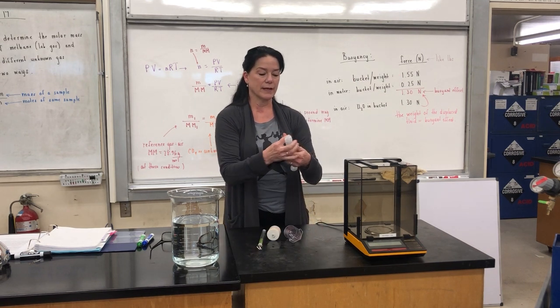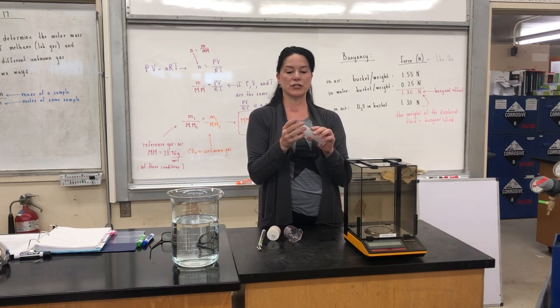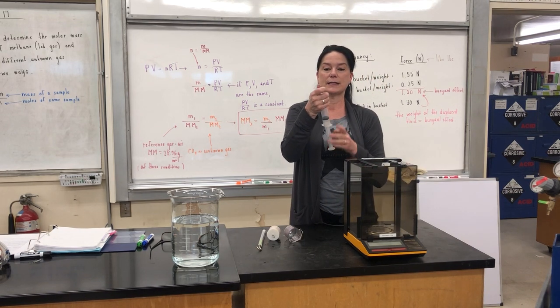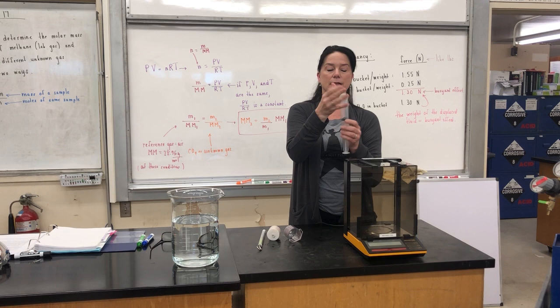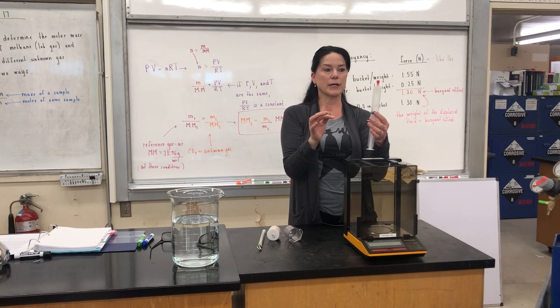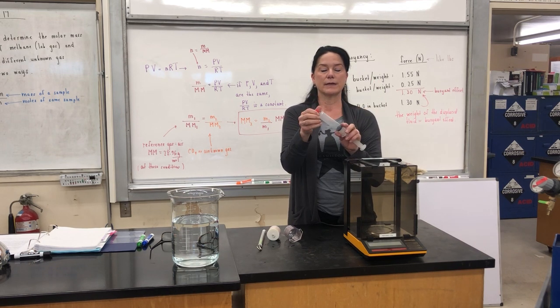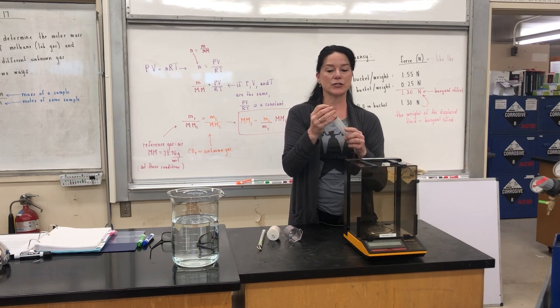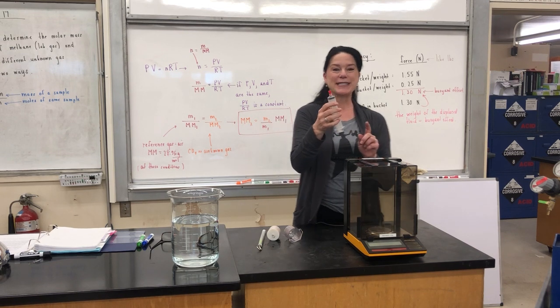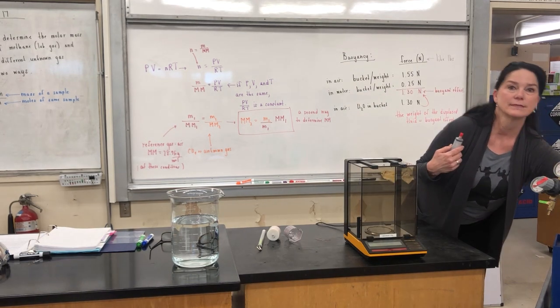Well, you might think, if I want to know the mass of the syringe, and then we're going to add a gas and get the mass of the syringe with the gas, the mass of gas is just the difference in those two, but it's not true. And we're going to prove that to ourselves by collecting some numbers. What I really need to do is get the mass of the syringe when it's open to the same volume. So Stu, I'm going to need you. When it's open to the same volume but contains nothing inside. So here's a nail. Okay.